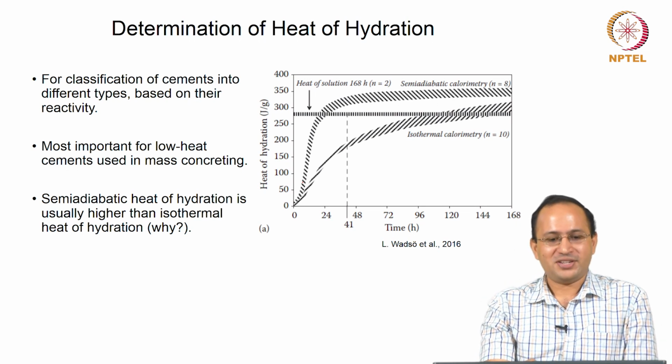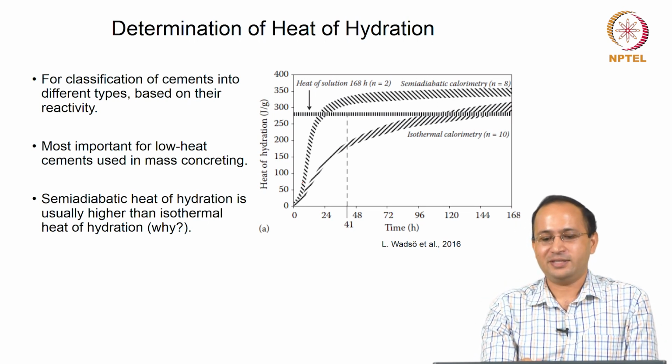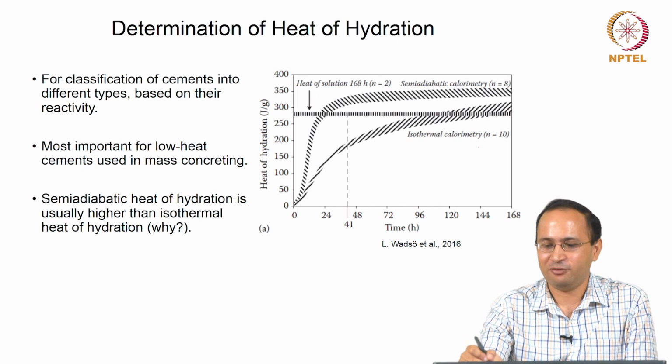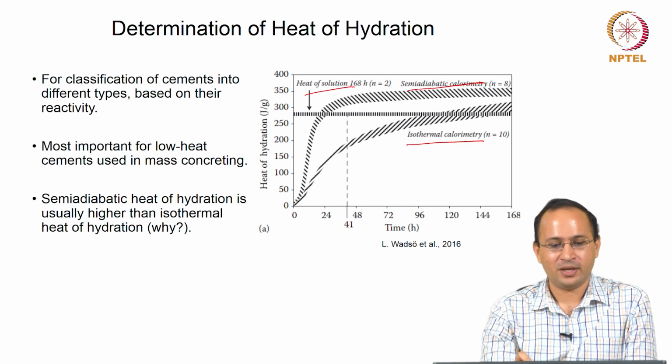Okay. So, starting with determination of heat of hydration. Simply what you do, you prepare your sample, and in case of here the plot, you compare 3 different techniques actually: isothermal calorimetry, semi-adiabatic, and heat of solution.